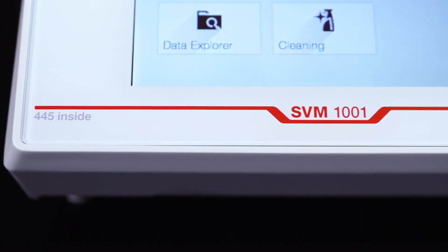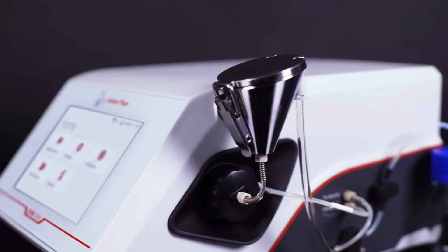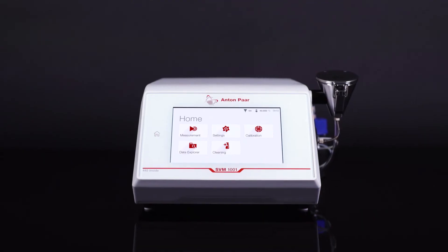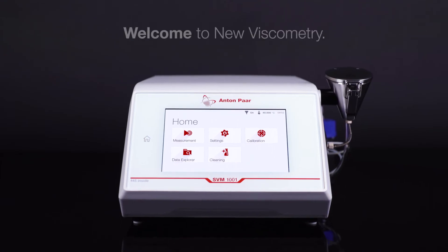SVM 1001 challenges the status quo of lab routines, defies the established, and reshapes the possible. Welcome to new viscometry.